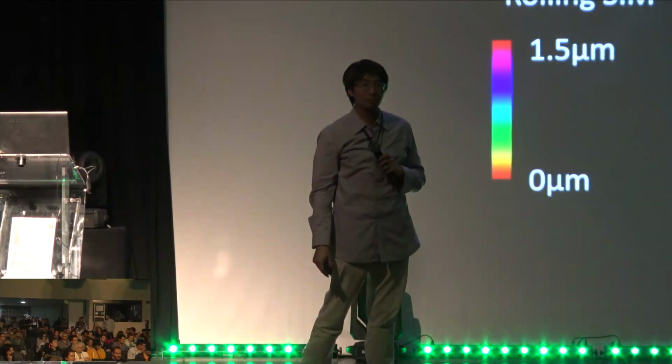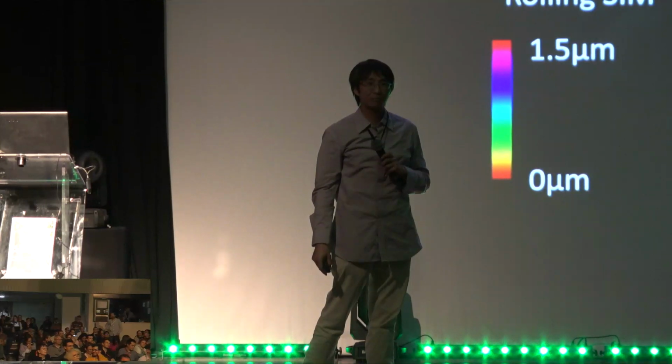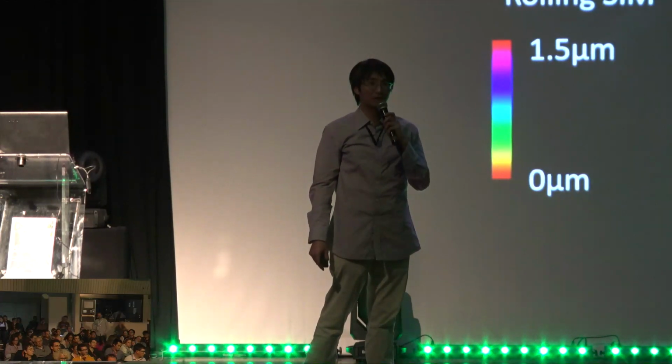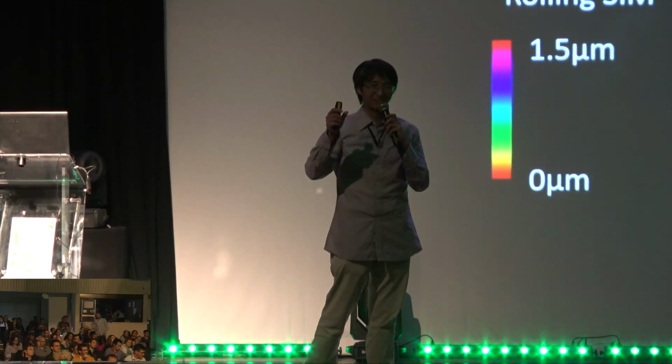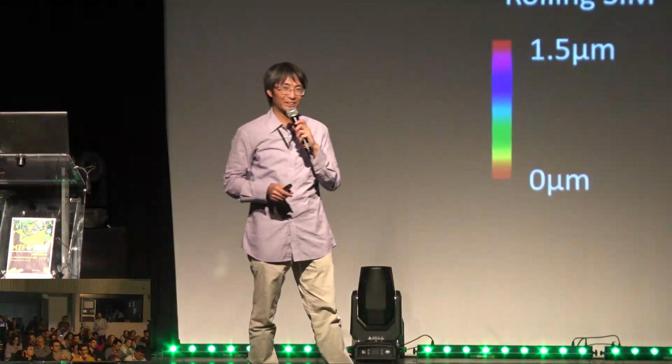How stable is your system, like a regular OPM system that you're using? And what do you think are the most critical parts to keep the system stable? What misaligns the easiest? Are you asking about the stability of OPM or OPM SIM? OPM, the OPM. Okay, so for OPM, it's quite stable, I can tell you.